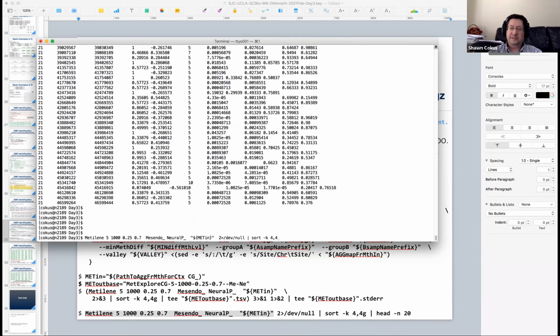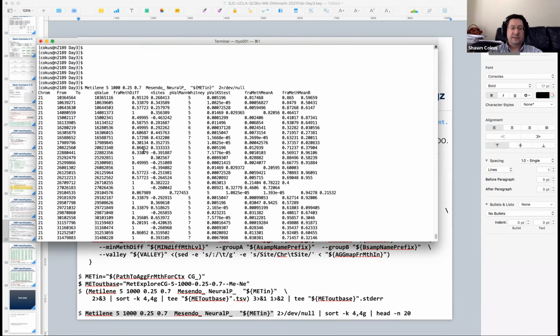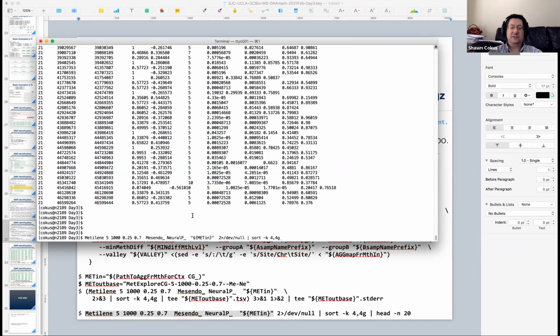Should it compare it by dictionary strings, or is it integers, ascending order? No, it's a free format C style float. These are all okay. None of these show scientific notation actually, but you can see here that sometimes the floats use scientific notation, E minus 05, 10 to the minus 05. That could happen in Q value too, although it's less likely because the Q values tend to get adjusted to fairly pessimistic things here. So to make sort understand the possibility for things like this in the float, you have to use the g, which is general number.